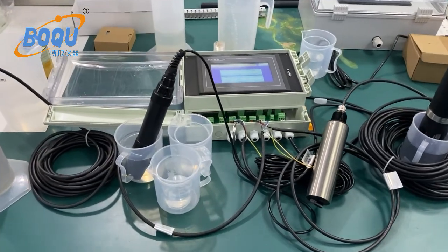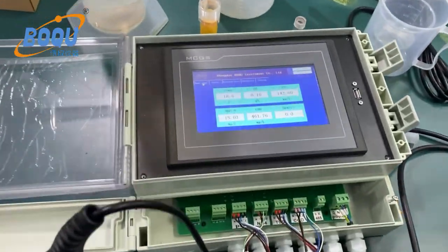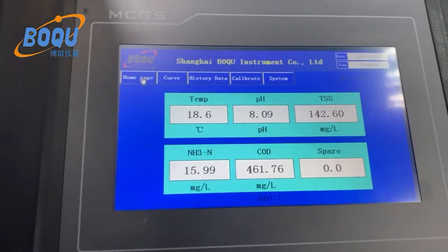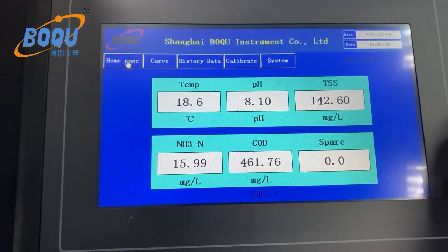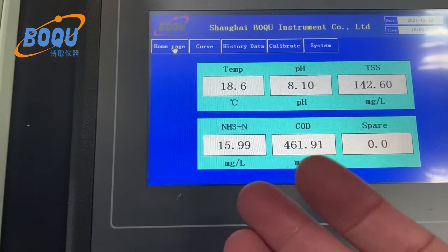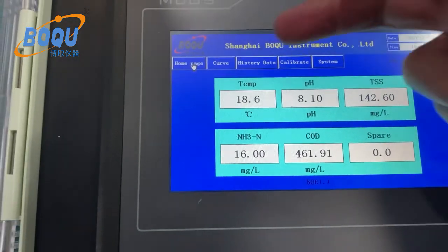Now we can check the operation — a simple introduction. Here is the main display. The main display shows the measured value and time. You can see temperature, pH, suspended solids, ammonium nitrogen, and COD.